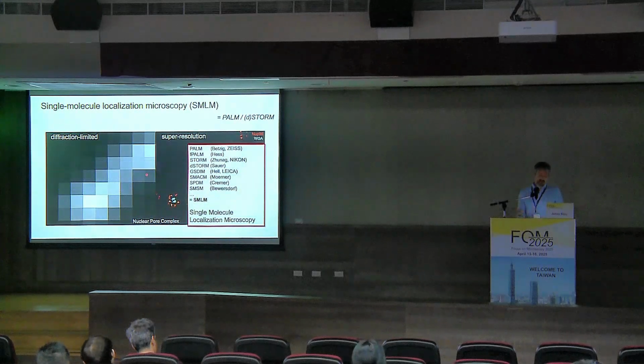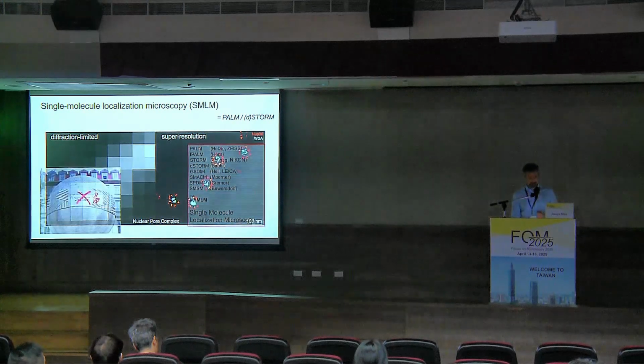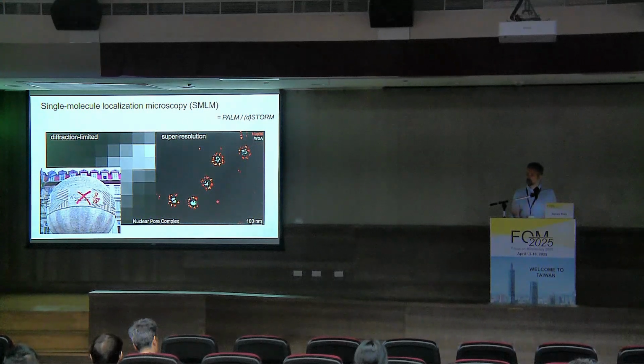So this technique, when it was developed independently by several groups and improved by others, has been given many different acronyms, and the list nowadays probably goes on even longer. This is why I think it's quite useful to call them with a common term, and this is nowadays, I think, single molecule localization microscopy. Although some of these terms are still used to denote specific variants of this technique. For instance, PALM often is associated with photoconvertible proteins, dSTORM with organic dyes in a blinking buffer. I'll come back to this. So the development of this trick of using blinking fluorophores now allowed us to overcome the resolution limit of optical microscopy, so we end up with a new super resolution limit.